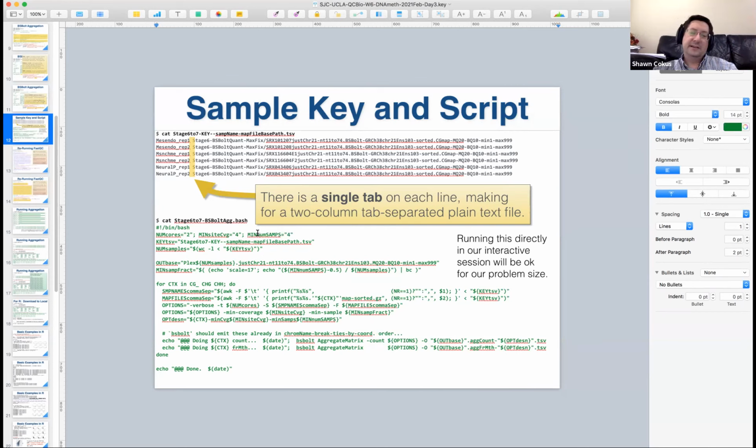So what's going to happen is that, peeking ahead a little bit, one of those tissues doesn't have its coverage completely in the same place as the other tissues. And so often these 2 missing guys are going to be 2 replicates of the same tissue. So in a way, you can think of it as allow one tissue to be gone, but there's nothing that's going to force the 2 missing guys to be from the same tissue, right? It's going to move around. I didn't want to make it 6 and just go for a completely solid file where all lines are present, because I wanted to show you in R how you handle the missing data case.